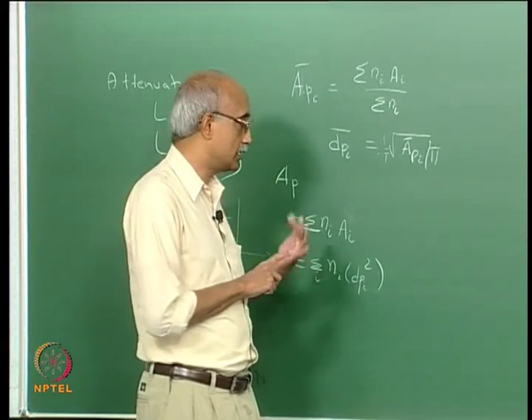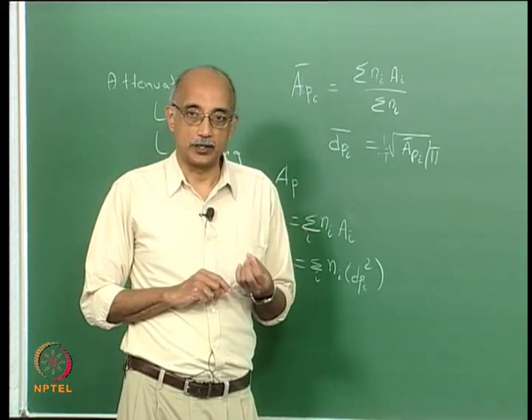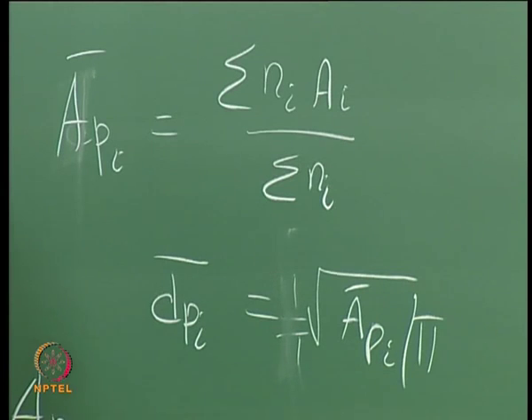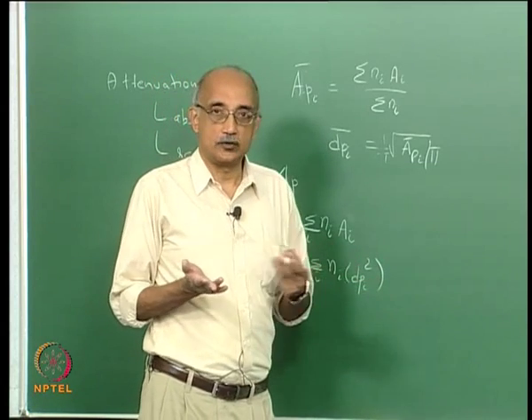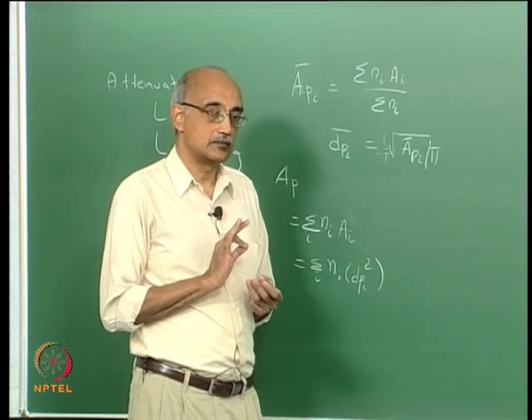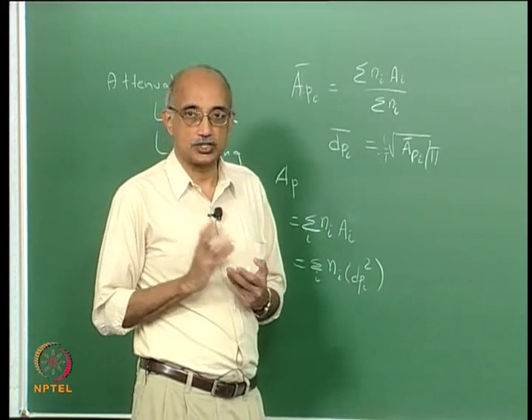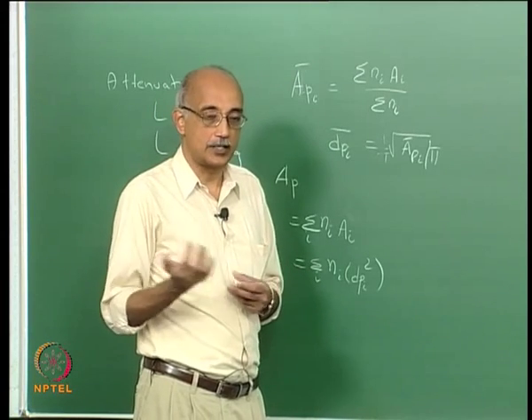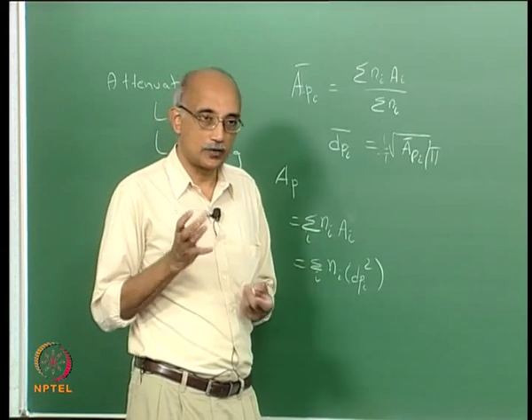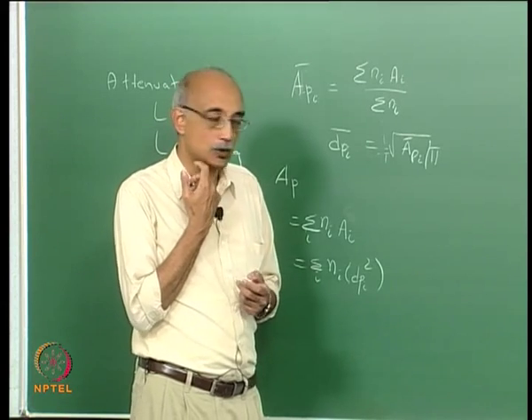The second is that the inherent sphericity assumption is another one that we always have to keep in the back of our mind. But this restriction of the assumption of a spherical particle, as we will see, is applicable to virtually every technique we talk about. Particularly the light scattering type of techniques all make the implicit assumption that the particle is at least roughly spherical in shape. There are very few theories of light scattering from highly non-spherical particles. The assumption always is that the sphericity parameter that we had discussed earlier is reasonably close to unity.